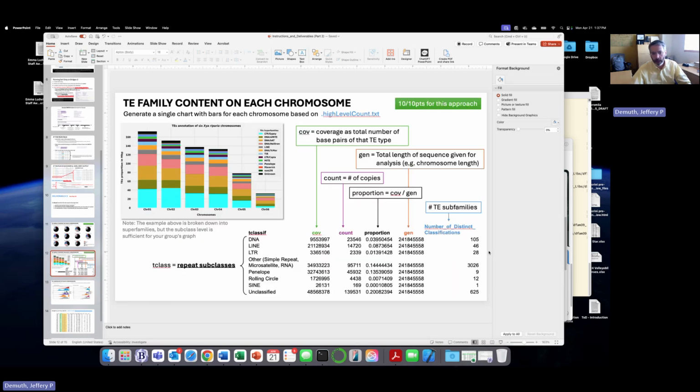The updated Earl Grey may have these tables. It's constantly trying to get better, so this might be a prettier table than this even. But it has all the information you would need to turn this into a stacked bar chart, for example.